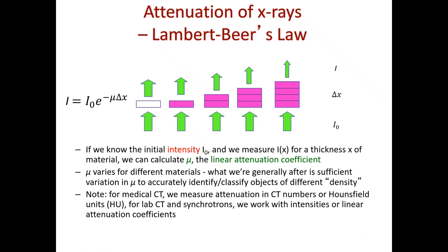and you could scale that image and stretch it to just 0 to 255, which is 1 byte, and then you're also saving memory. And for the application, recognize whether you really have enough contrast between two different densities that you're trying to image, or you don't, which depends on the CT settings itself more than anything else. If you can visually see the contrast, then you have enough contrast, and whether you express it in numbers that are up to 255 or numbers that are up to 65,000 doesn't matter really.